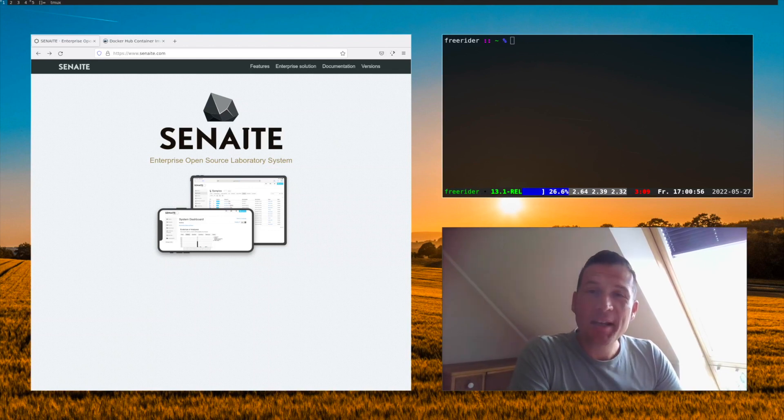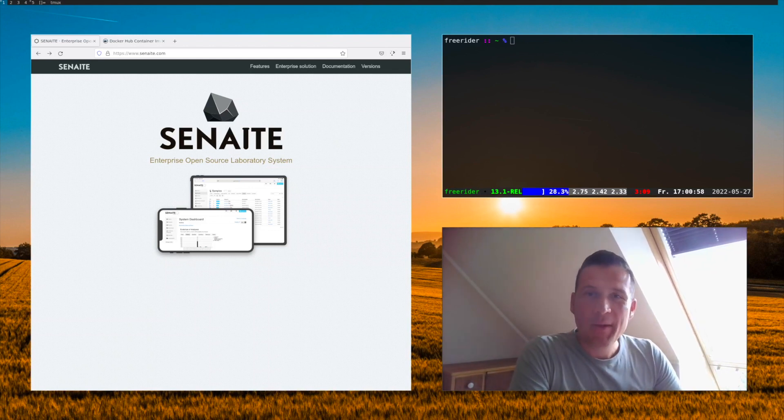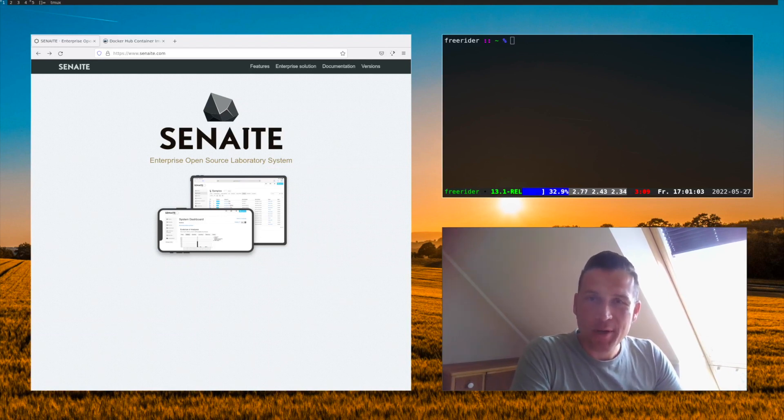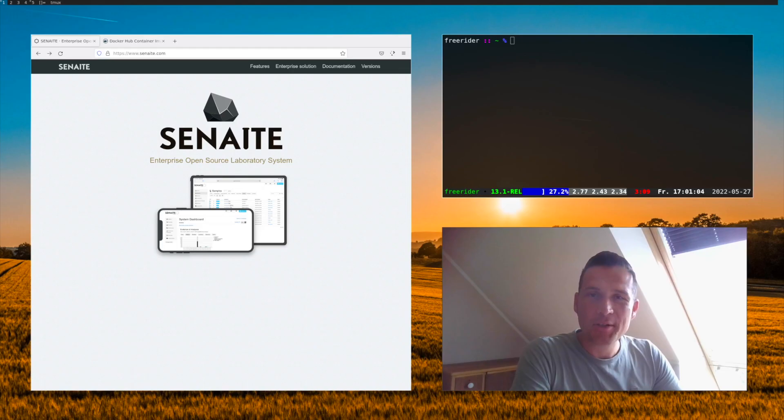How to run Senn8 LIMS in less than five minutes. This is the challenging topic of today's video and I'm going to show you how you can achieve this.